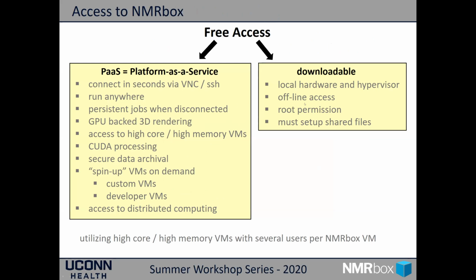And the downloadable version, you're going to download and run on your own local hardware, and you're going to need your own hypervisor. So you're going to need VMware Fusion or VMware Workstation or VirtualBox from Oracle. One of those, or there might be others as well, but those are the most popular.